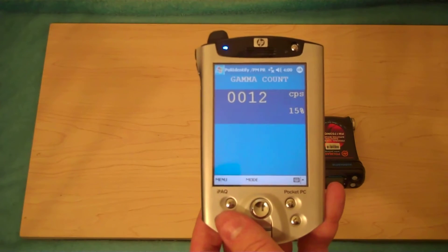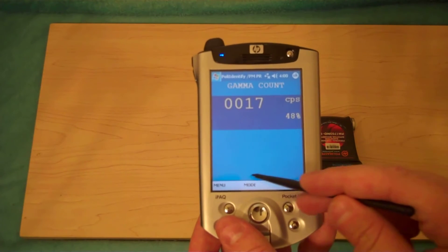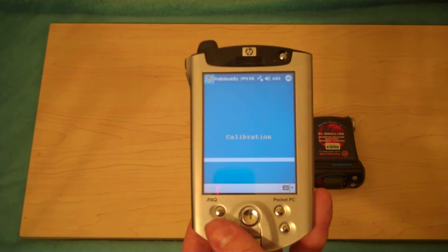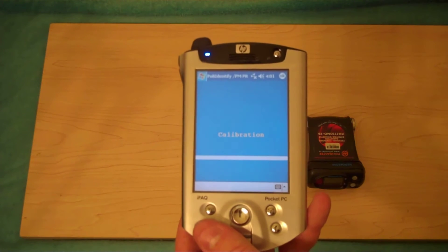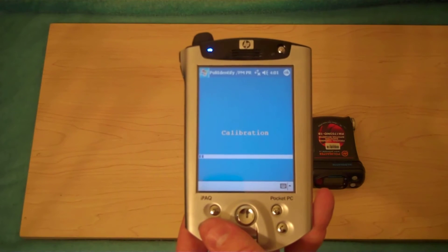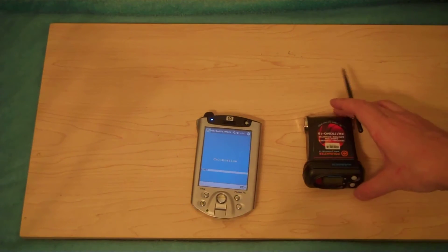This is actually detecting all the gammas in the area and giving you a real actual dose rate. Of course you're seeing counts per second right now, but in dose rate you're seeing the real dose per energy, not calibrated against Caesium-137. Now we're going to start a calibration for temperature, background counts, and so on.